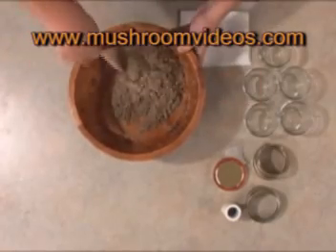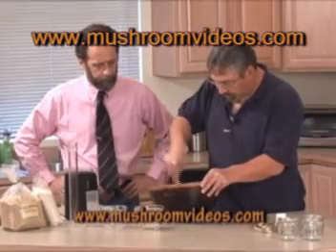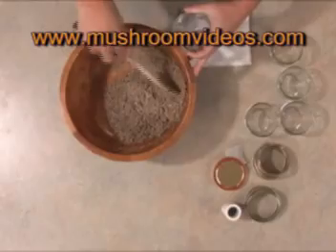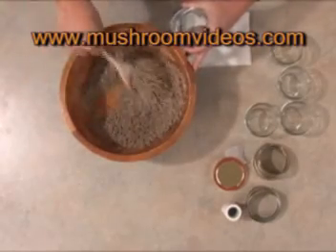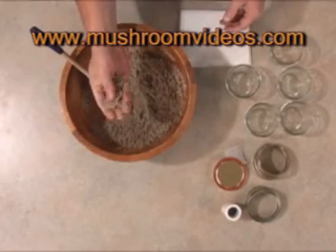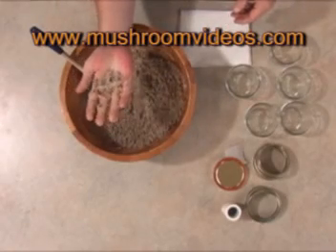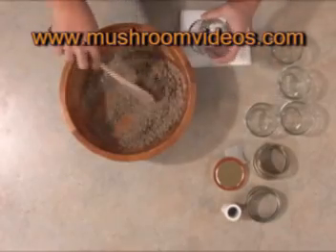We'll get it mixed in really, really good so that the flour is coating all of the vermiculite. We have our vermiculite and our brown rice flour really well mixed. It's really fluffy and airy with really nice moisture content — you can see that it's damp. So what we want to do now is start filling our jars.